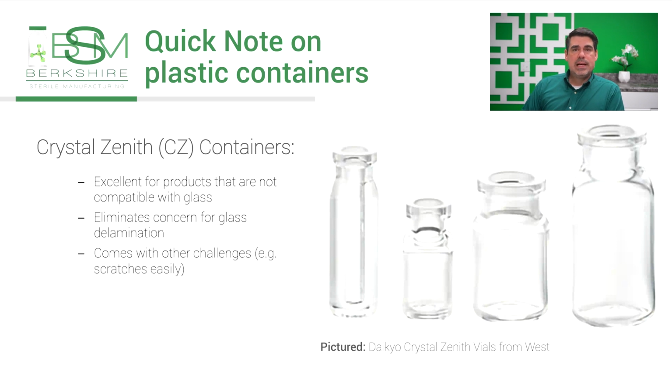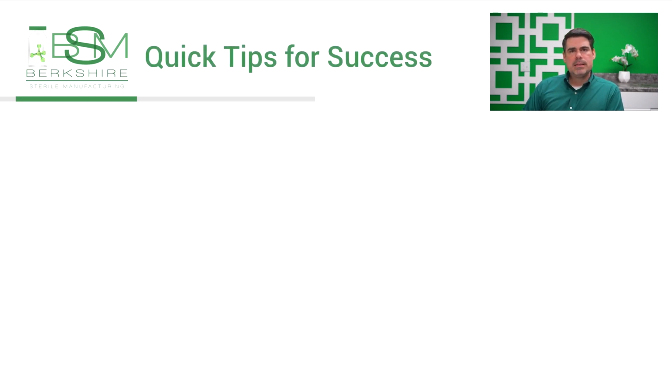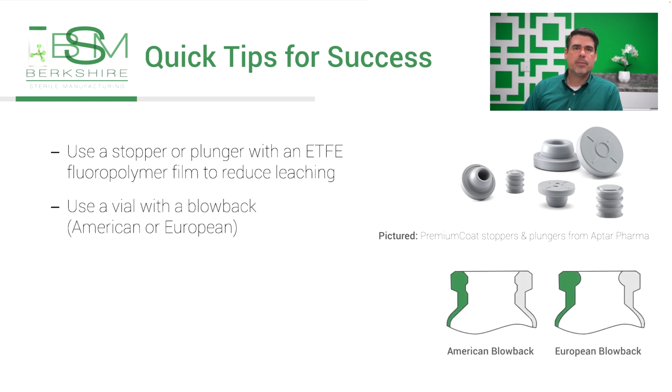For example, plastic is much easier to scratch, and where most filling lines are processing these containers with stainless steel tools, they're much more prone to becoming scratched, and this can lead to cosmetic rejects. So it's all a balance to determine what your product will need. But for the majority of products, it's best to use a stopper or plunger with an ETFE fluoropolymer film to reduce the risk of leaching, and a vial with a blowback, either American or European.